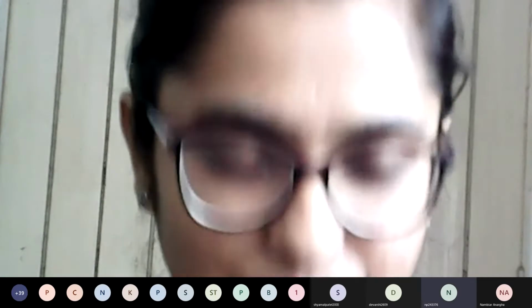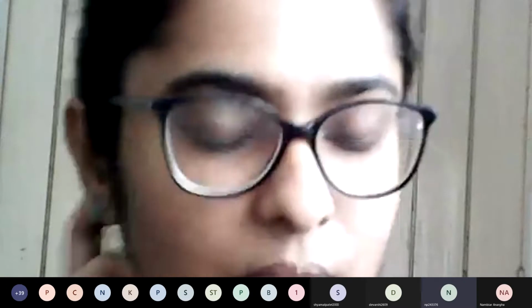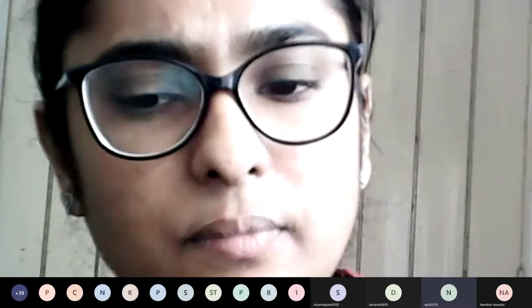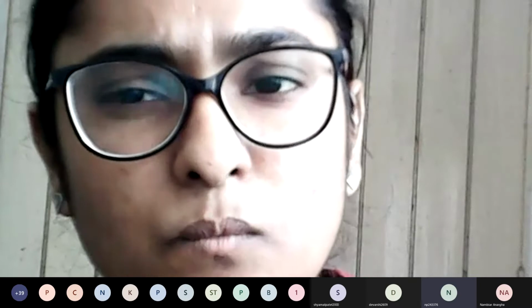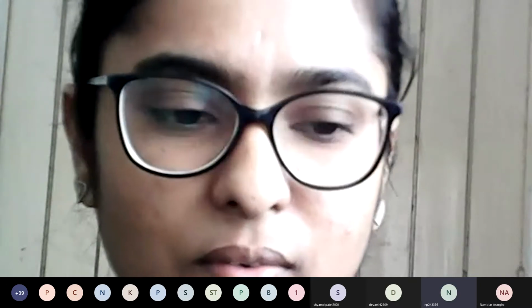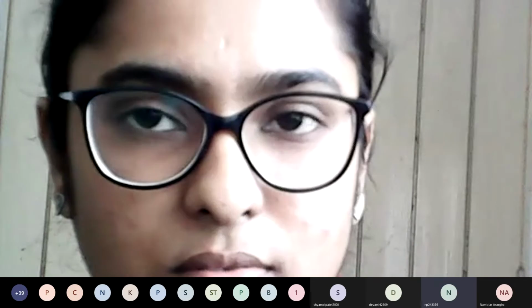Yes, ma'am. According to you, the color change is yellow to red, but in videos we see that the color changes from orange to blue. Then which one is right, and which one should we say in examination? Orange to blue it was.